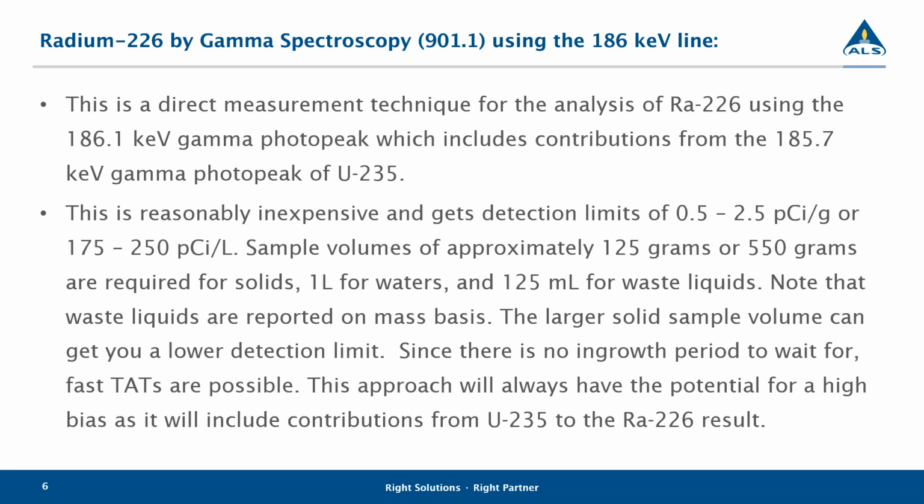You're going to get a fast turnaround on this. You can get okay detection limits, pretty low on soils, a bit higher on waters, but there is a high bias on here. This is a good approach, though, if you are going for a waste sample and you just need to know, I need to be below this limit for the landfill, because as long as we get a result and it's below that limit, even if it's biased high, it should work for your project.